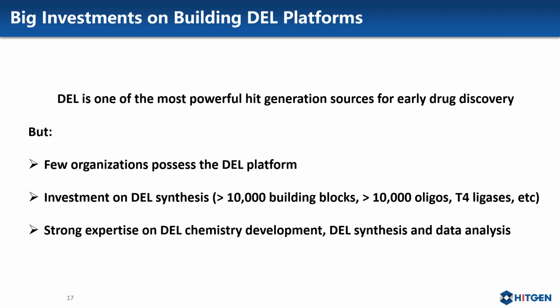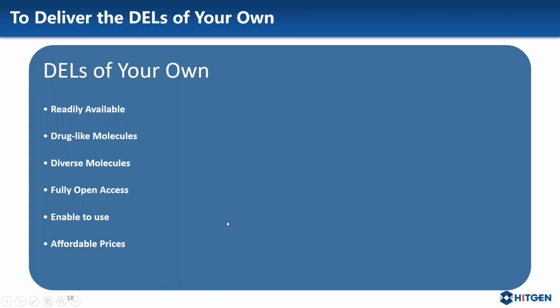It could be very helpful for researchers to have DELs commercially available for direct use. What's the idea on-shelf DEL product? What are the features of these DELs? For users, some elements may be considered before ordering DEL products from vendors.